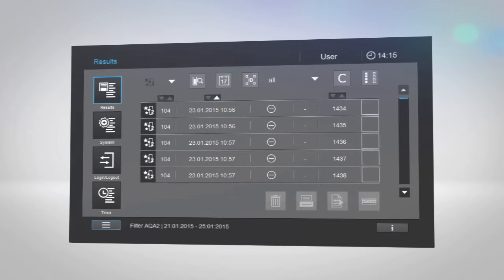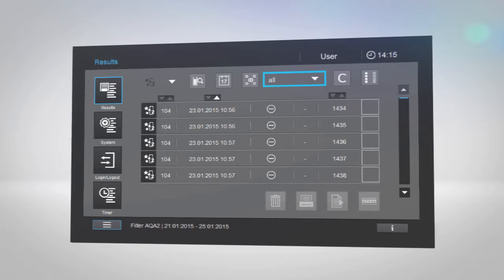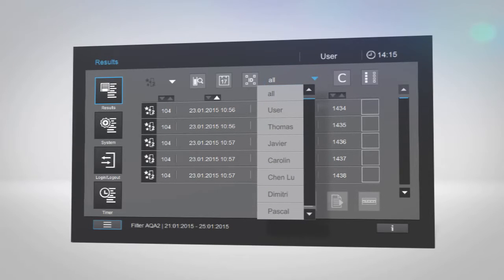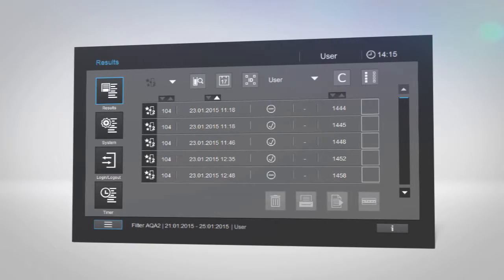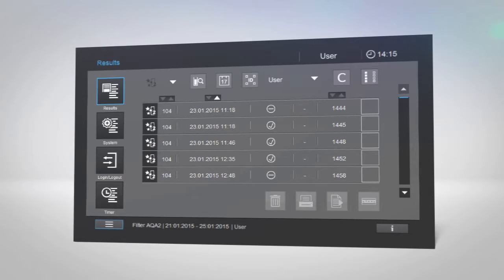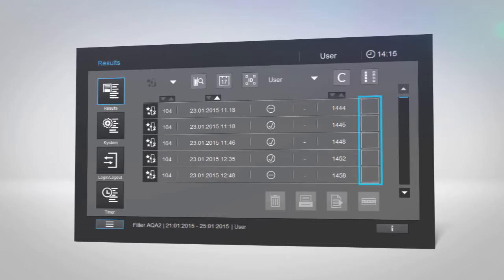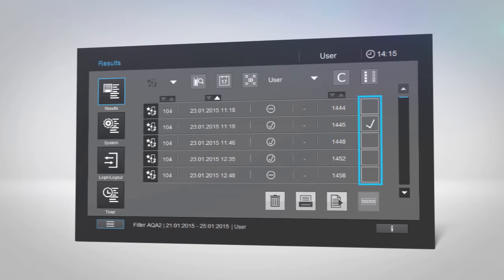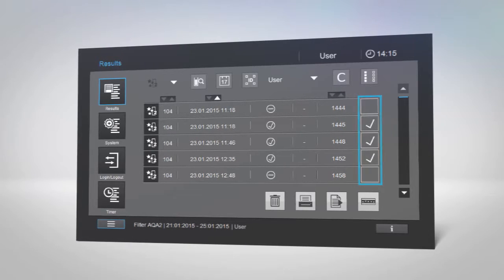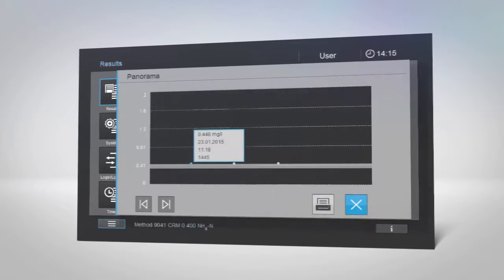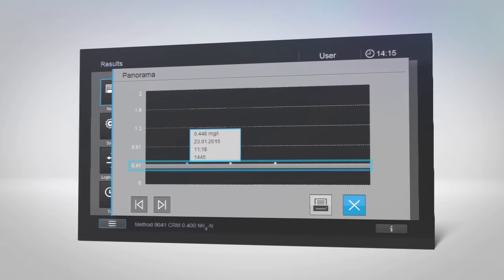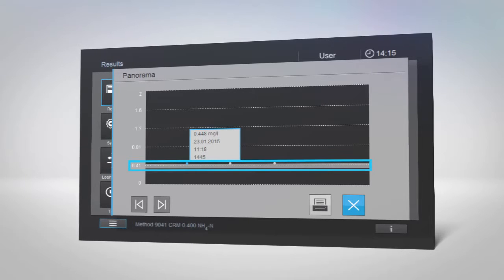To filter by username, tap the Options menu at the top, then tap User and select the desired username. SpectraQuant Prove also provides you with a trend analysis, so you can study multiple measurements of a particular method at once. Select your desired results by tapping the empty square beside each measurement, then tap the Trend Analysis button. You can now monitor if your results are within your defined range or not.